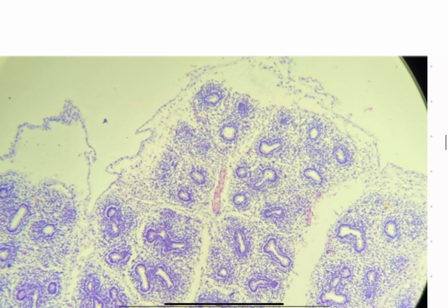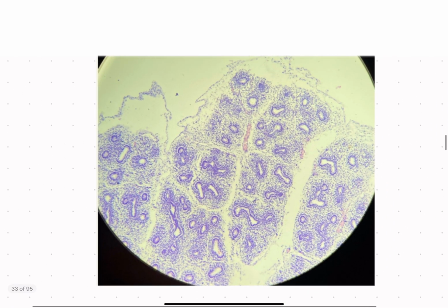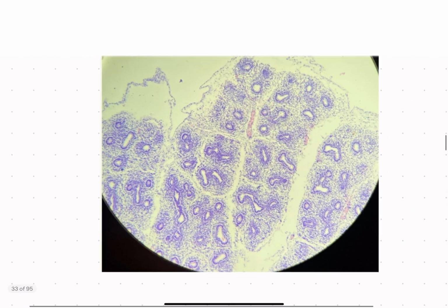We can also see blood vessels within the lung, which is another point of contention that is easy to mistake for other structures as well. Some students assume that these are bronchi if we can't see the characteristic red blood cells within. And of course, we have the smaller bronchioles in the center with the mesenchyme within.